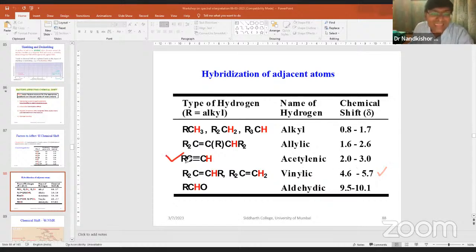Whereas in the case of acetylene, there are two structures. One is linear, another one is horizontal. Because of that, one structure is reinforcing, another one is opposing. So the net result is less because of these two structures of acetylene. There are two structures, the linear and vertical.